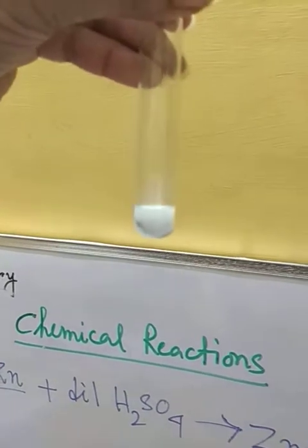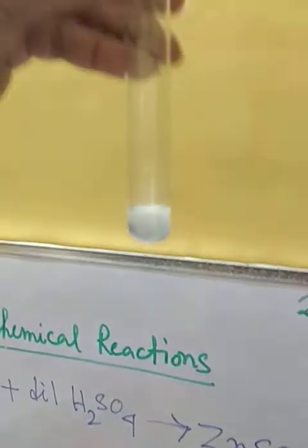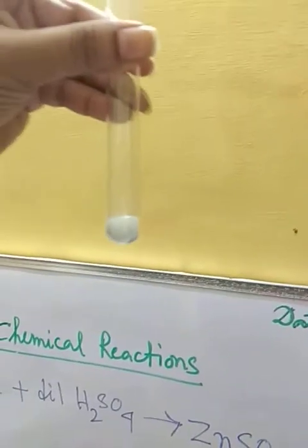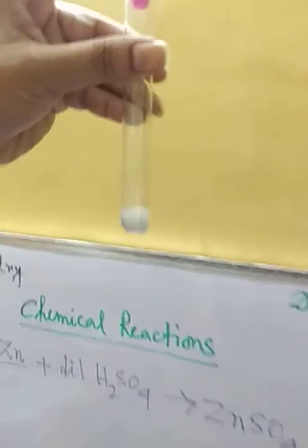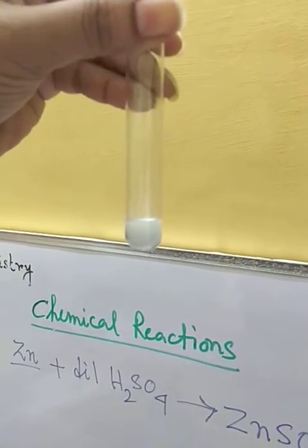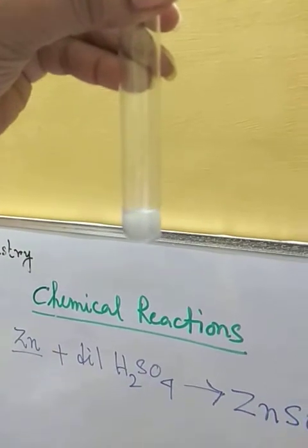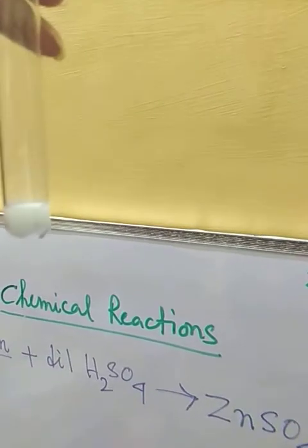Hope you can understand that the reaction has started and it's going on. As the reagents are still there, the reaction is going on and it's producing hydrogen continuously.